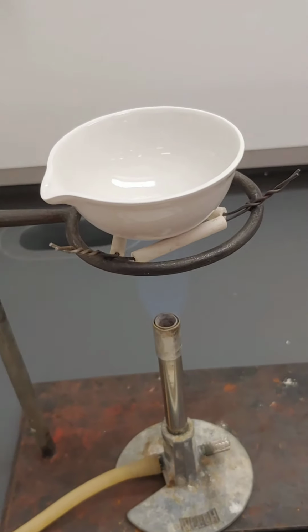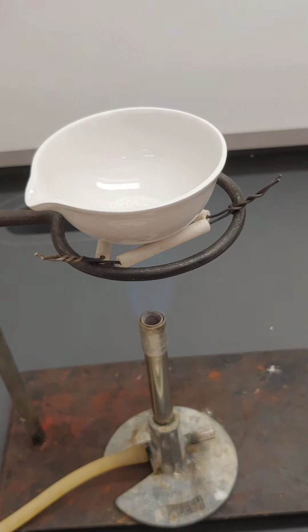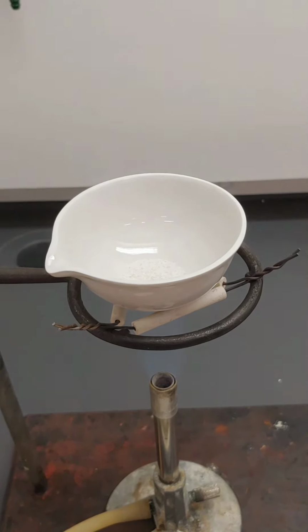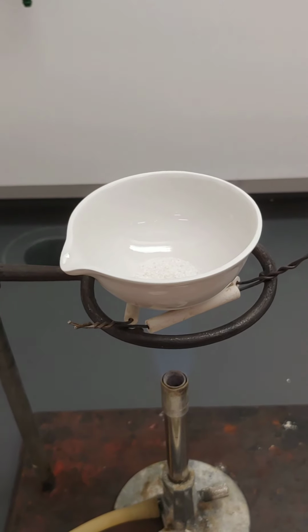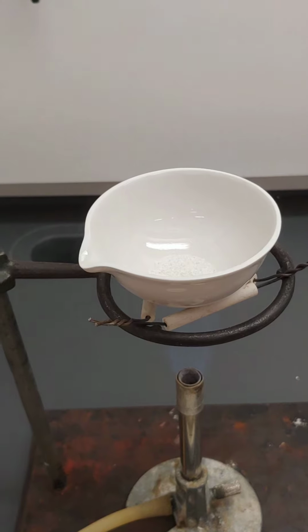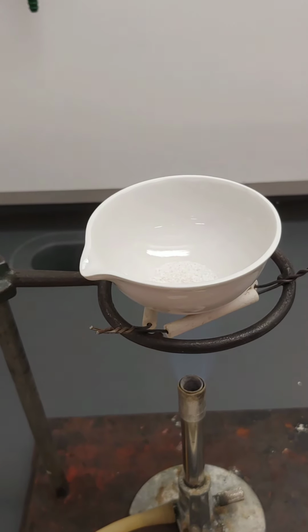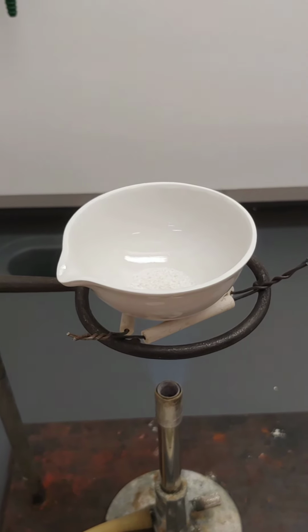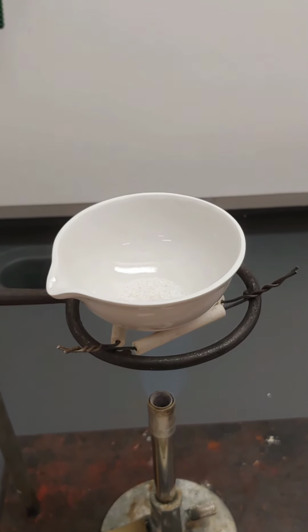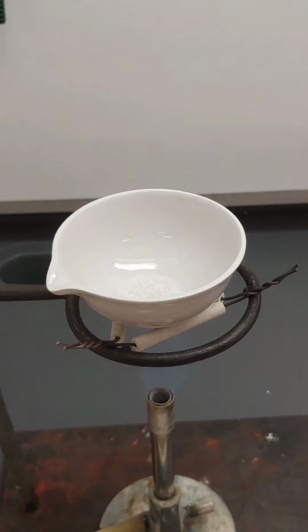And so what should happen over time is that within a few minutes that ammonium chloride should start to sublime once the temperature gets to about 350 degrees Celsius. And I'm going to continue to allow that ammonium chloride to sublime off. It could take about 15 minutes until there is no more of it left. So again, I want to make sure that I'm getting all of it out.